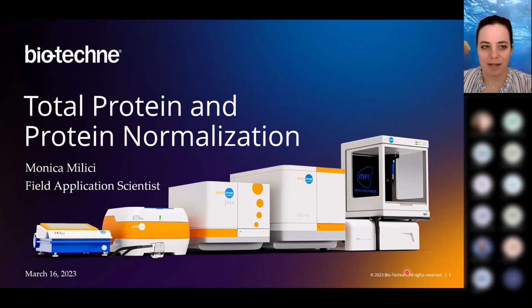I am going to be talking to you today about total protein and protein normalization with our Simple Western systems.